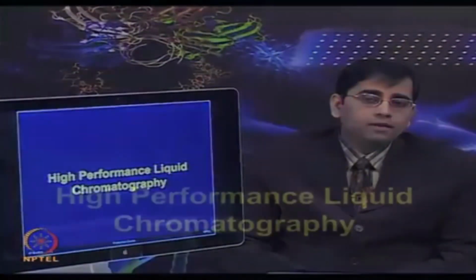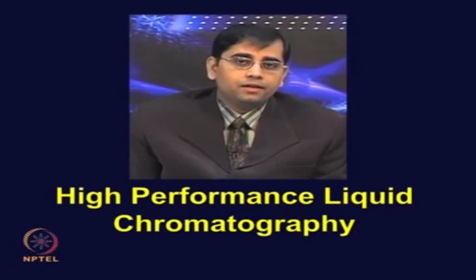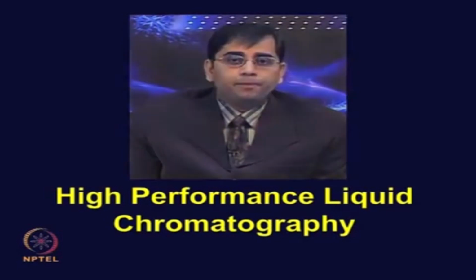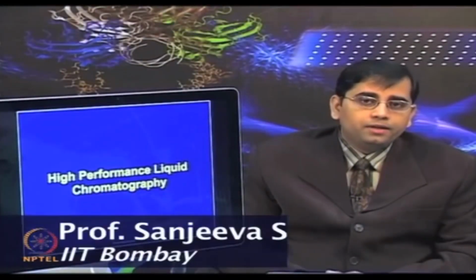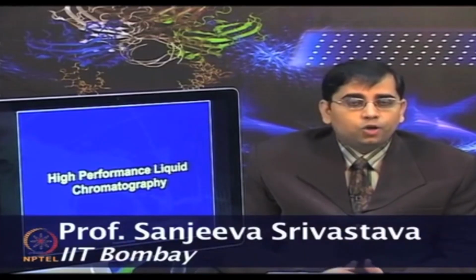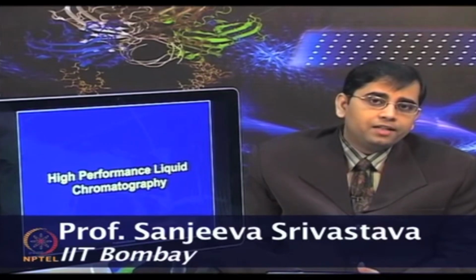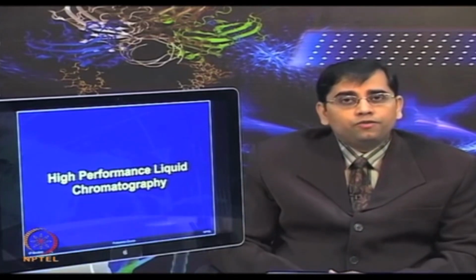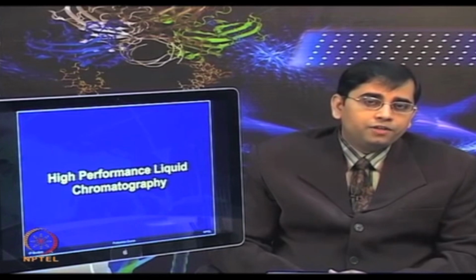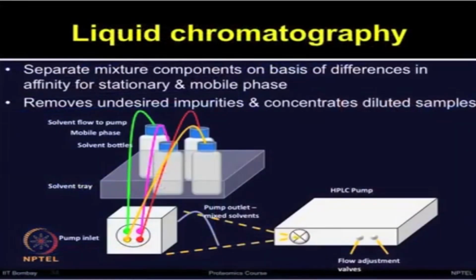Let us now talk about high performance liquid chromatography, HPLC. HPLC is a separation technique that separates molecules based on their differential adsorption and desorption between the stationary phase matrix in the column and the mobile phase. Better separation and resolution of the components can be achieved by HPLC. So, what is liquid chromatography?